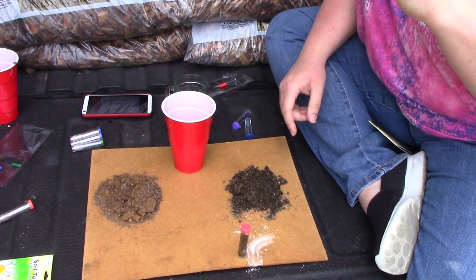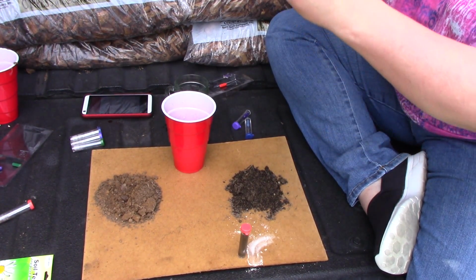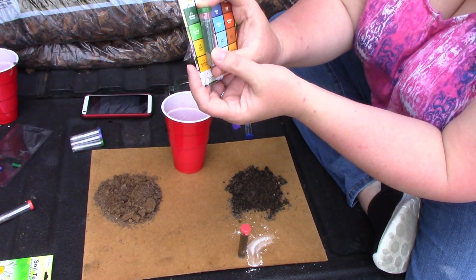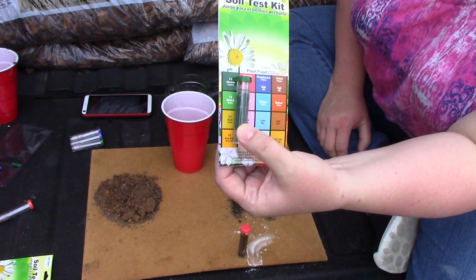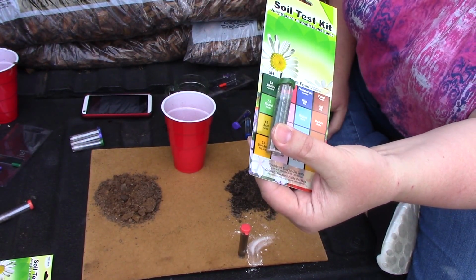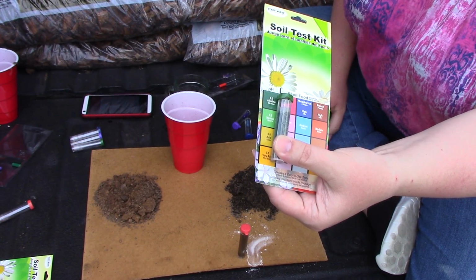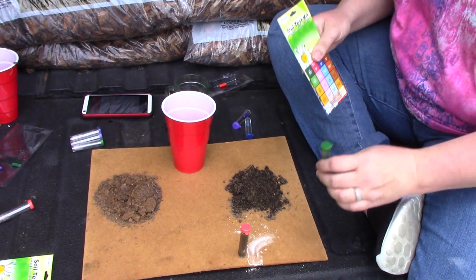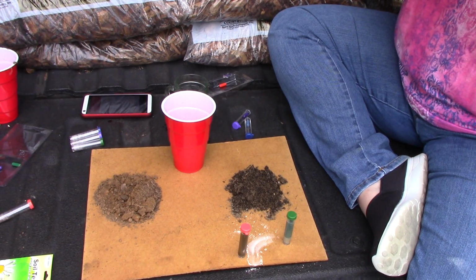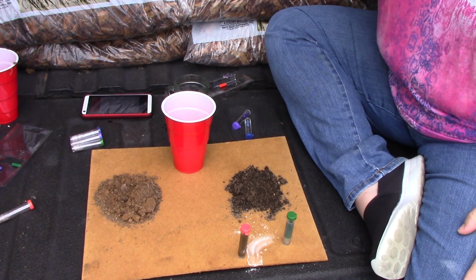Has it been a minute yet? It's been a minute? Yep. Alright, so it's been a minute on the pH level. So I look at this, and where's it at? I can look at the difference, and it shows that it's pretty alkaline. The lighting's not that great, but that means that our amended soil is alkaline. If the pH is alkaline, it says it can be adjusted to provide more.